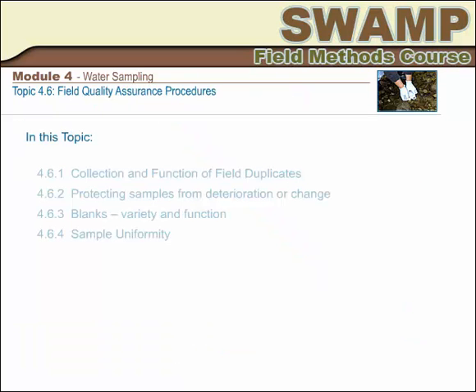The quality of the data you collect depends on the way that you collect it. As you perform your sampling activities, ask yourself at which steps you may introduce error or contamination. In this way, you will naturally figure out ways to prevent or minimize error. Common Element B also shows you how to effect, that is, control, check, record, and report the quality of your measurements and your samples. Beyond being aware and careful, there are several formal procedures to assure and check quality, and this topic provides information on those that are relevant to water sampling.